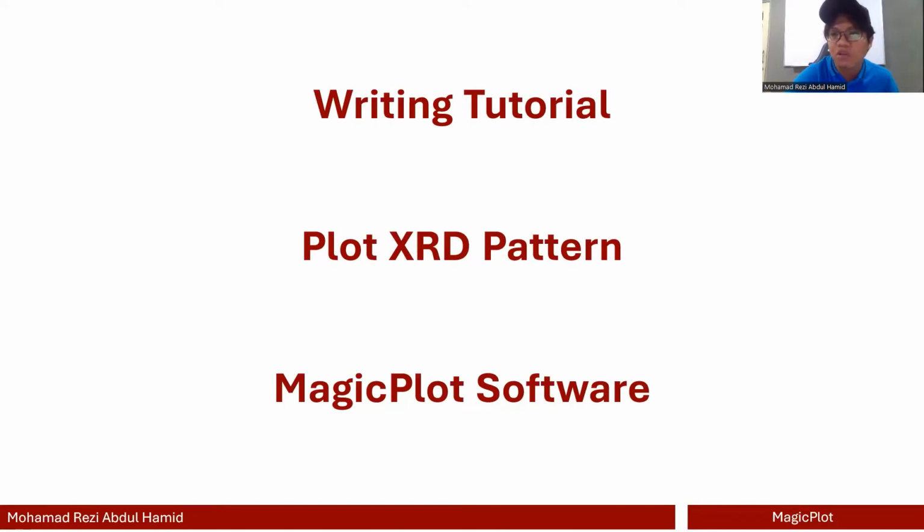The full-spec software can be used to do a lot of stuff, but the student version is enough for you to create a very nice plot for your thesis or even your publication, because I think most of you are probably graduate students, like PhD or master students, or even undergrad students trying to complete your FYP project, for example. All right, so as I have mentioned just now, today our task is to plot an XRD pattern, a nice XRD pattern using the MagicPlot software. So let's begin.